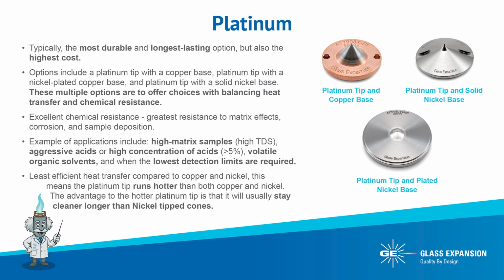And now let's move on to platinum cones. Platinum is the most durable and longest-lasting choice, but it also has the highest price. Just like with nickel cones, you have several material combinations to choose from: a platinum tip with a copper base, a platinum tip with a nickel-plated copper base, and a platinum tip with a solid nickel base. These options are designed to balance heat transfer and chemical resistance.